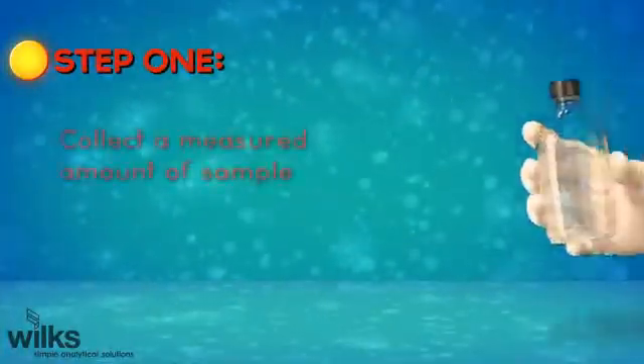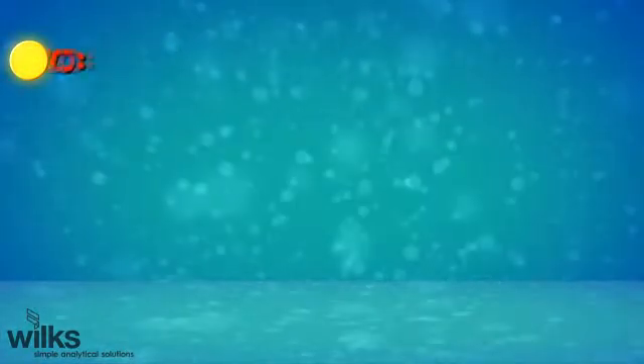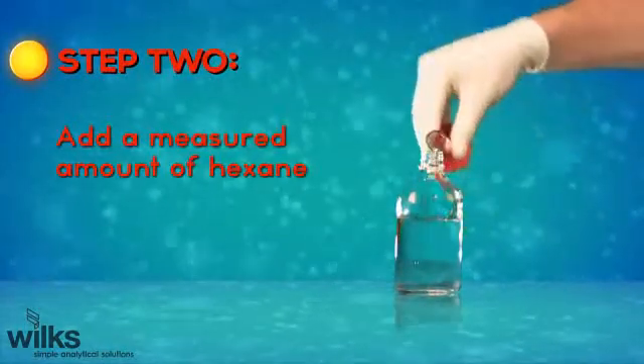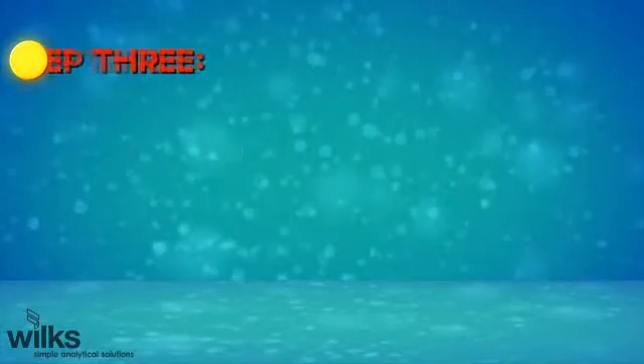Step 1: Collect a measured amount of sample. Step 2: Add a measured amount of hexane. Step 3: Shake for two minutes.